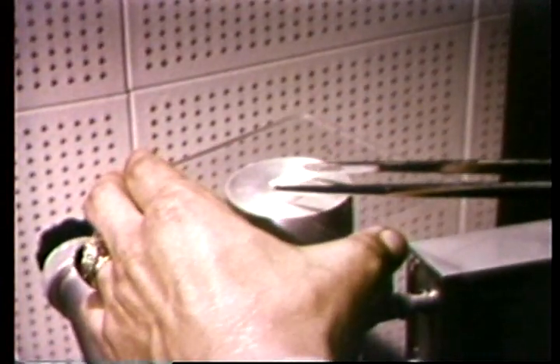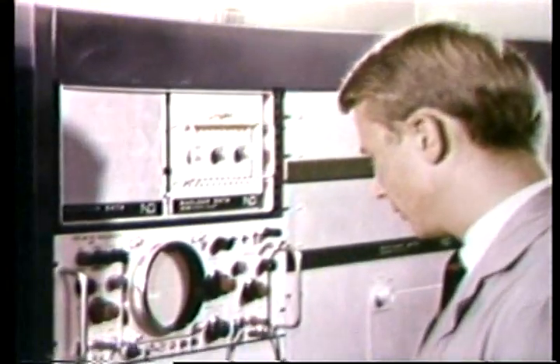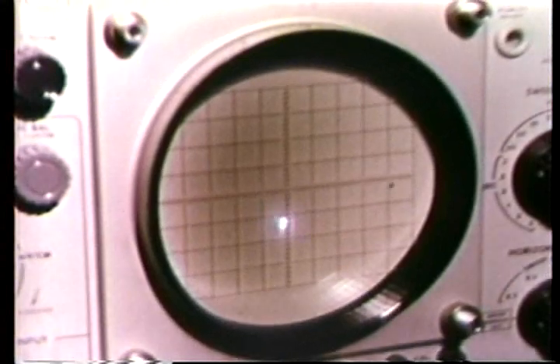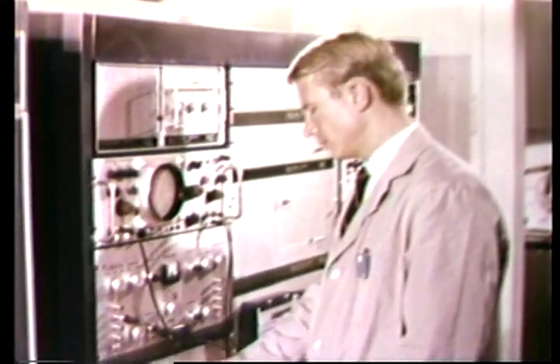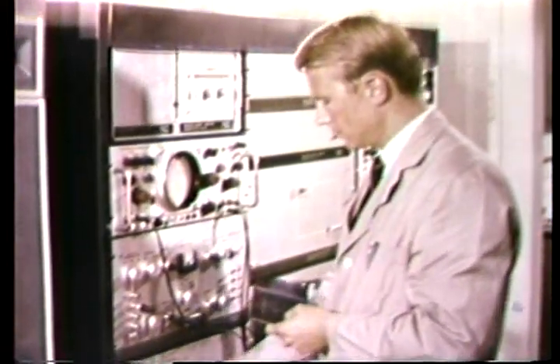In the neutron activation analysis unit, the examiner places samples, now partially converted into radioactive atoms, on a detecting device. This detector, coupled to a multi-channel analyzer, measures the emissions from the radioactive atoms and sorts them out so they can be individually identified. This process is continuously monitored on a cathode ray tube. After sufficient time for the data to accumulate, it can be photographed as well as read out on the viewing screen. The microscopic particles from the paraffin cast contain both antimony and barium as major constituents. These elements are characteristic of residues from primer discharges, and indicate the subject could have fired a gun shortly before the paraffin cast was taken.